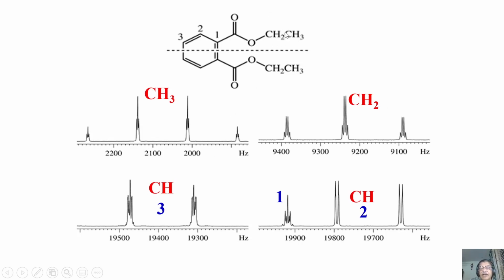This CH2, if you look at it, this carbon proton coupling is a triplet. And this carbon is coupled to these three protons. As a consequence, each lane of this triplet is a quartet. You understand? Similar to proton spectrum, but here we are observing carbon-13. We are seeing carbon proton coupling one bond and carbon proton two or three bond coupling. Okay, this is what we are seeing, and if you can see the spectrum of other carbons also, we can interpret like that.